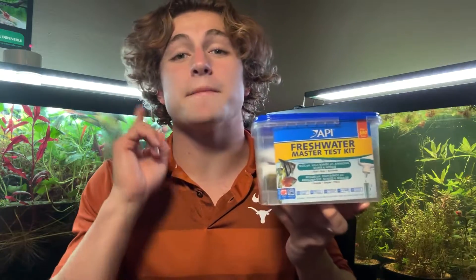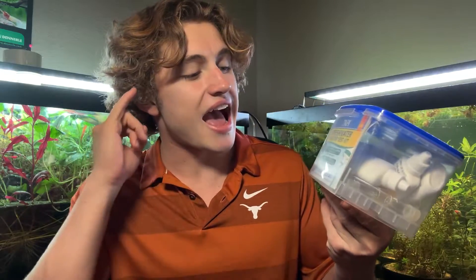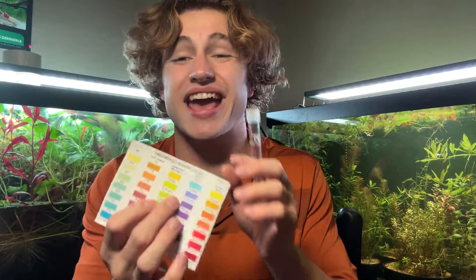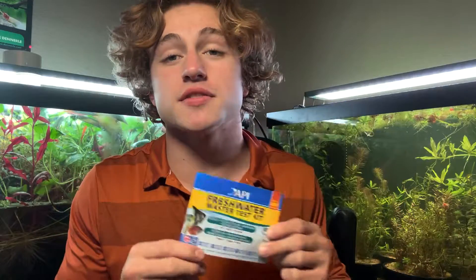This test kit comes with a pH range solution, a high pH range solution, two ammonia bottles, a nitrite bottle, and a nitrate bottle — and it's able to test all of those in your aquarium's water. It also comes with test vials that help you measure and test, plus a pamphlet that teaches you how each test works, with a chart on the back. If you forget any steps from this video, just check that pamphlet.